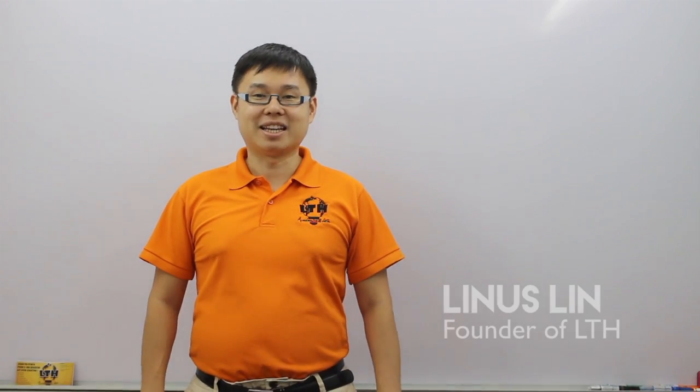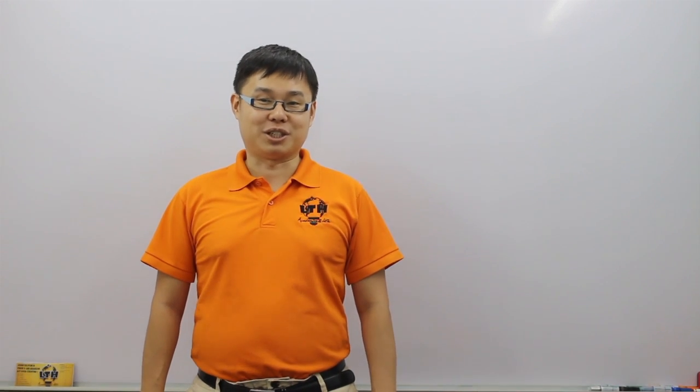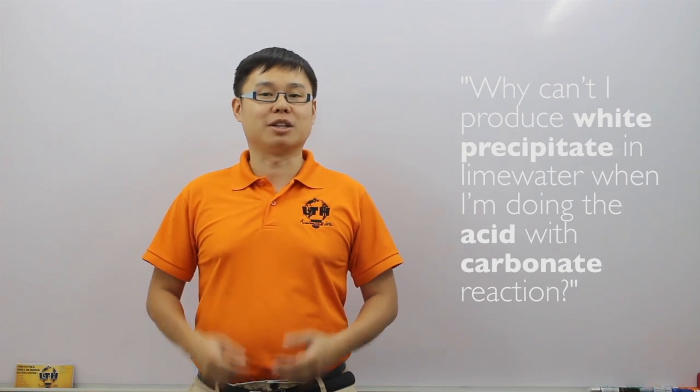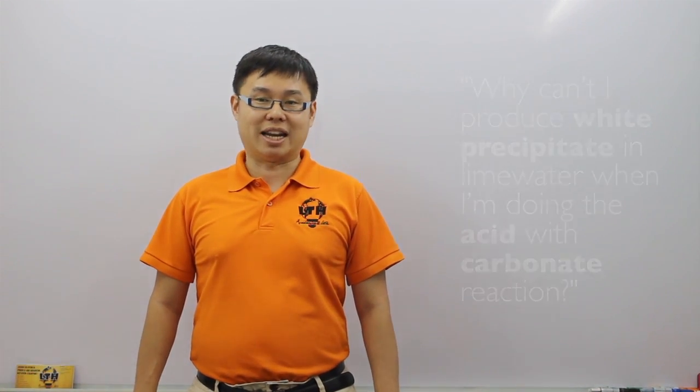Hi, my name is Linus Lin and I'm from LTH EduHub. Recently a student asked me a very interesting question. She asked why she couldn't produce a white precipitate in lime water when doing the acid with carbonate reaction. So I decided to look into her experiment and I discovered why.